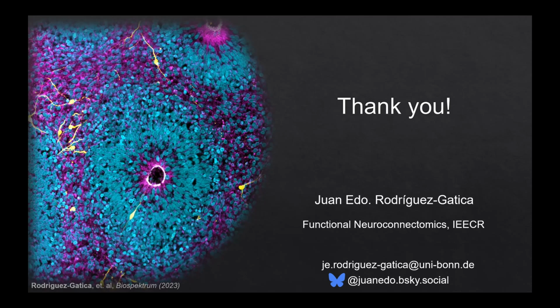What we usually do is, after embedding the sample in the gel, right, then before the digestion, we put that in the confocal. And with the confocal, we take a volume. And then you should be able to find that volume in the light sheet data. So that's what I showed you, the slices. You can try to find a region that is characteristic of your sample.